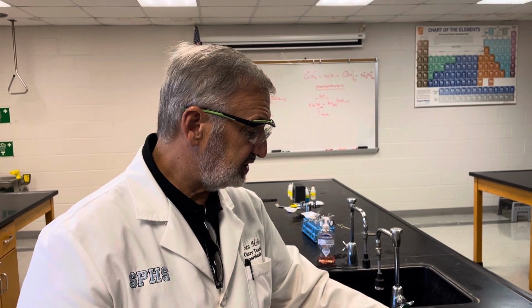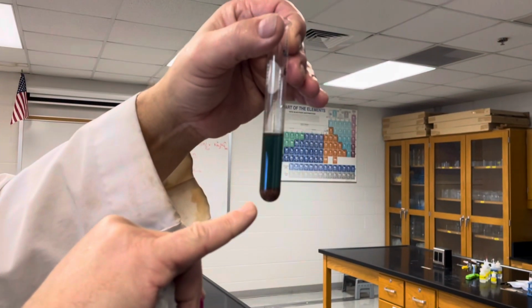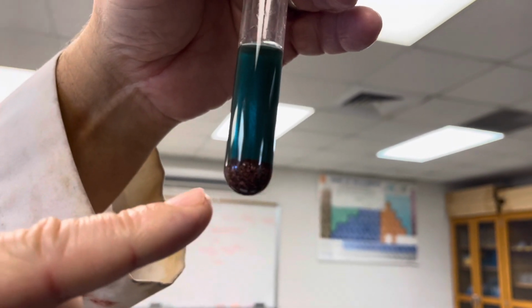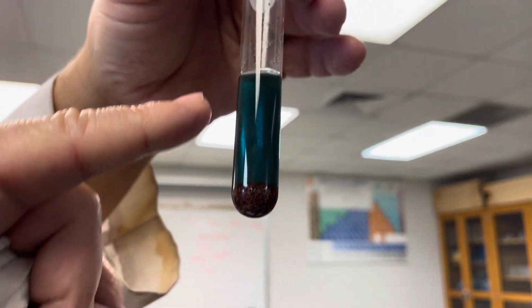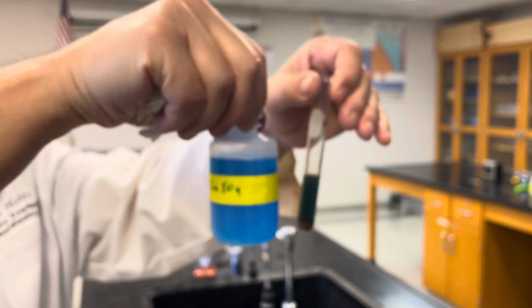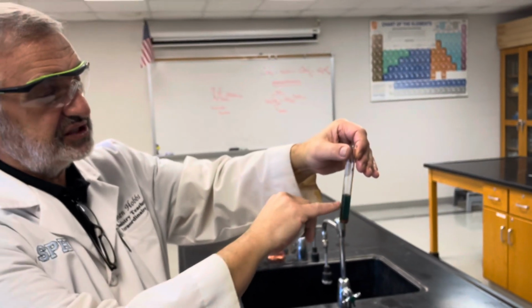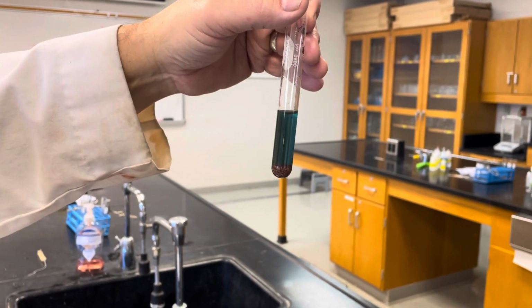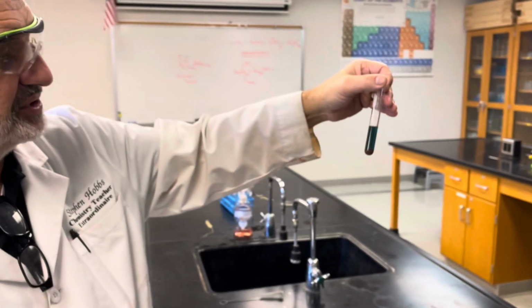Now I'm going to come back. I told you we'd come back and look. Okay, so now you can really see, this is that copper sulfate plus iron. You can really see the copper precipitate forming at the bottom, okay? And notice the color has faded dramatically, because the blue color is due to the presence of dissolved copper. So we need to write a balanced equation for this. So this again was that third equation where we put the iron in with the copper sulfate.